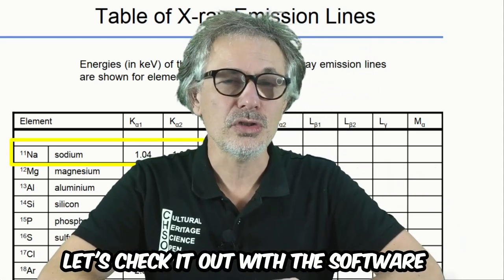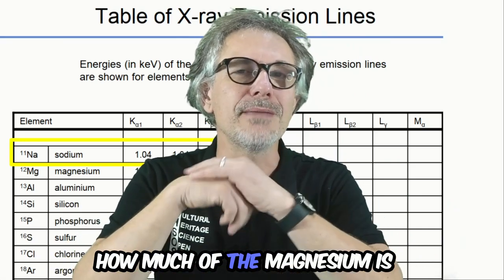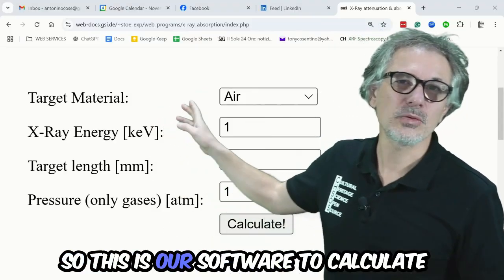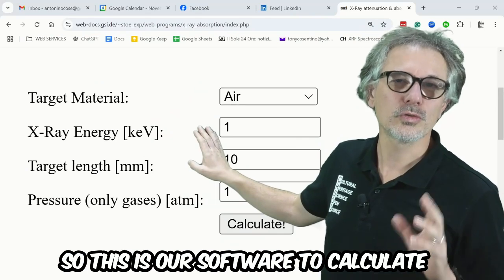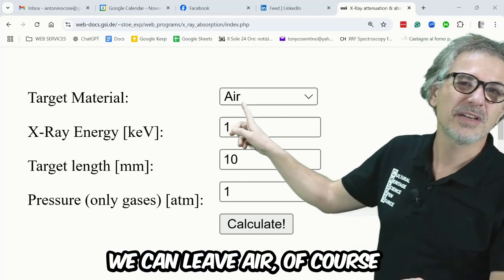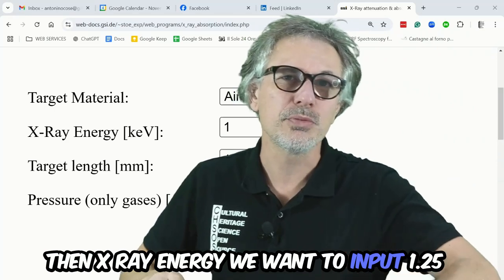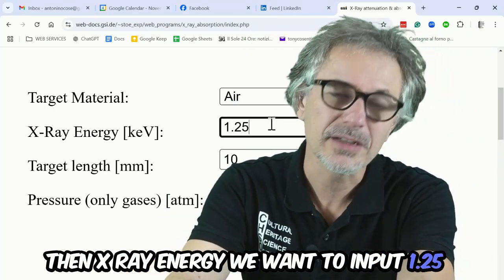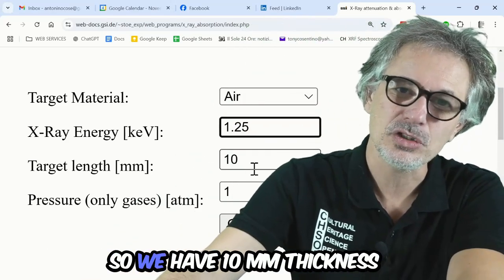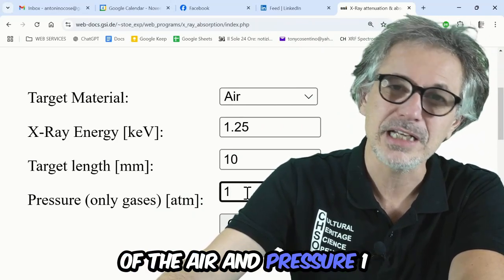Let's check with the software how much of the magnesium signal is expected to go through. There it is, our software to calculate this path. For the target material we can leave air, of course, and for the X-ray energy we input 1.25. We can leave everything else as it is, so 10 millimeters thickness of air and pressure 1.